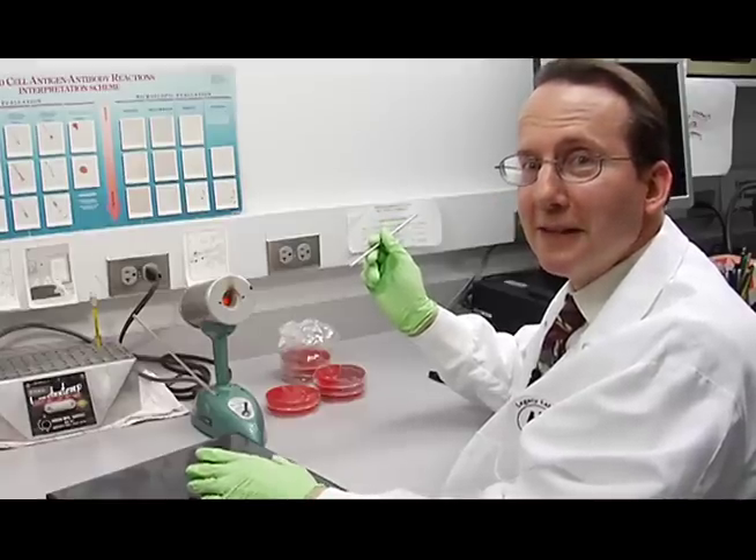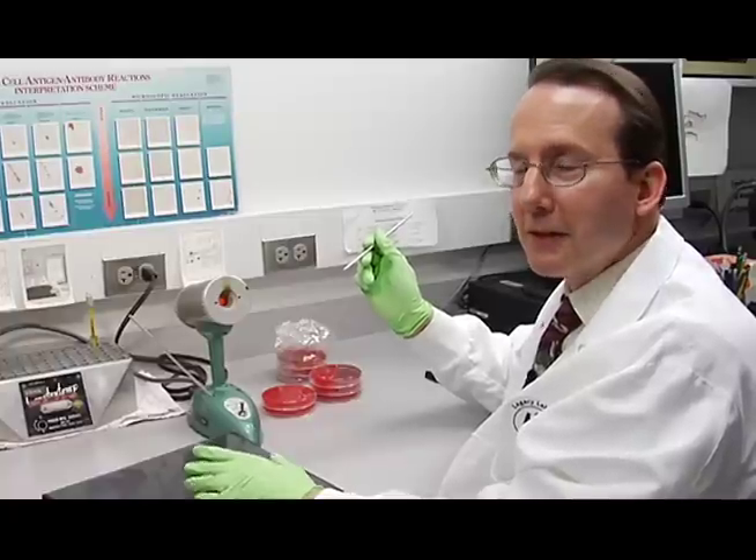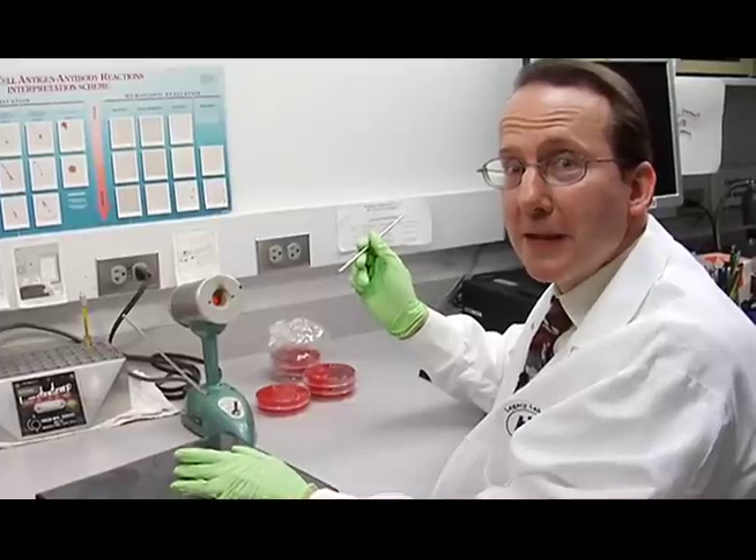Now that I'm finished streaking the Staphylococcus aureus subculture, I'm going to show you how to streak the Streptococcus pyogenes plate, and we'll show you the stab technique.